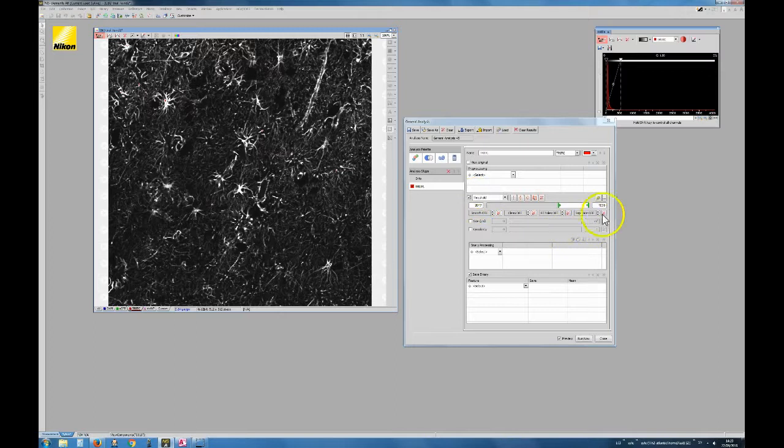Okay, there are several methods to run the segmentation and make this mask. One of them is called thresholding, but if you click here, you have different ways to select different things. Okay, and in here we also have other ways to select what it is. The simplest method for segmentation is thresholding, and all it does is decide above this intensity, this is my signal, below this intensity, it's not my signal. So it's a very simple way to make a mask.